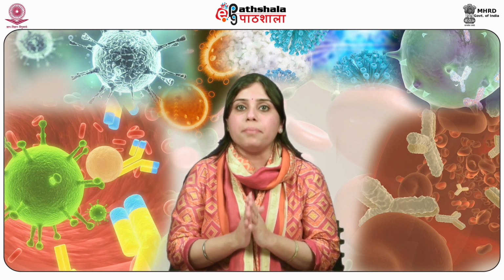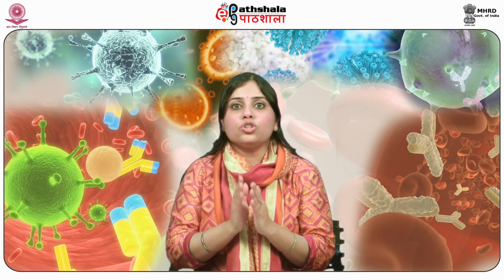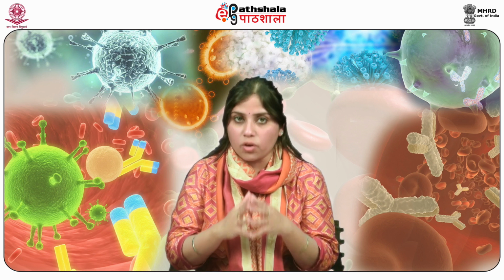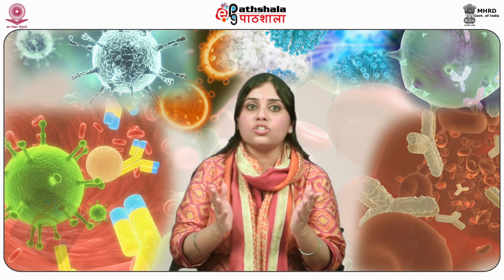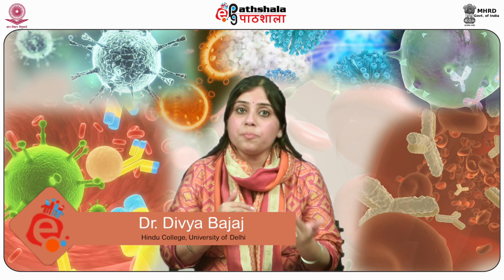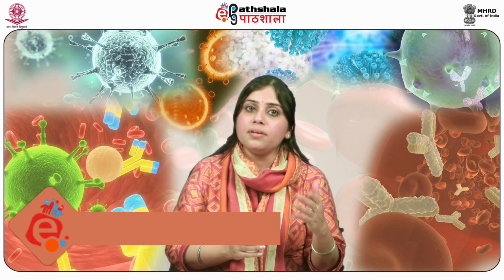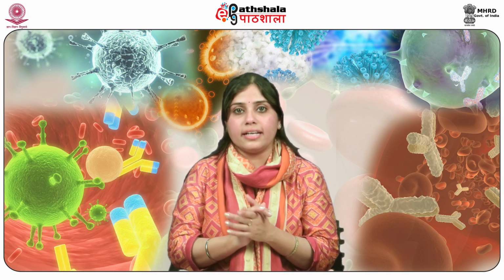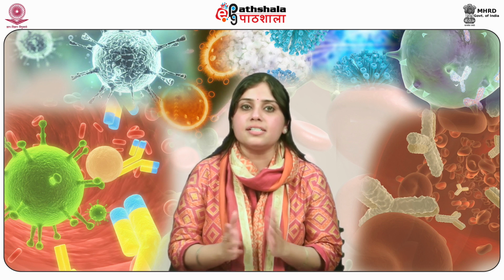Precipitation reactions are based on the interaction of antibodies and antigens, two soluble reactants that combine resulting into one insoluble product, the precipitate. These reactions involve formations of lattices or cross links. SPR is a non-invasive optical phenomenon that allows label-free means of observing interactions occurring during binding of an injected analyte to an immobilized biomolecule in real time.